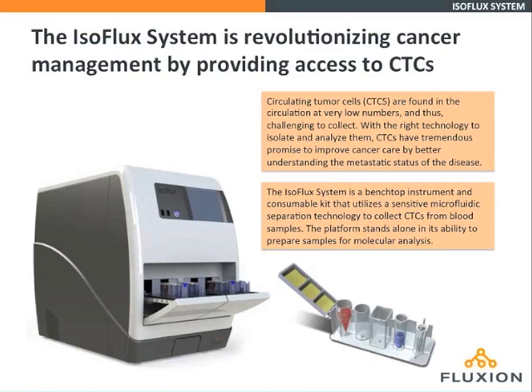So this is what the system looks like. It's basically a benchtop system that starts from typically a blood draw sample and works to enrich and present the CTCs in a sample format that's ideally suited for molecular assay work.